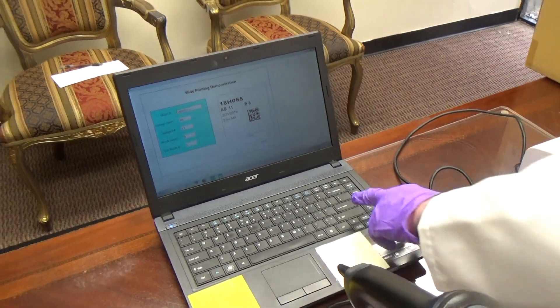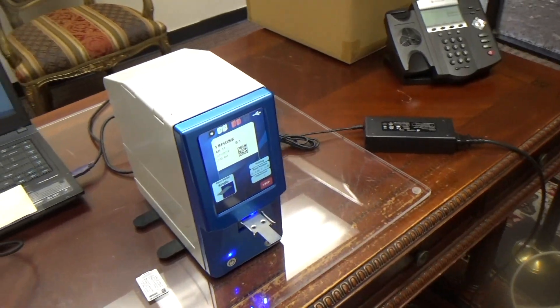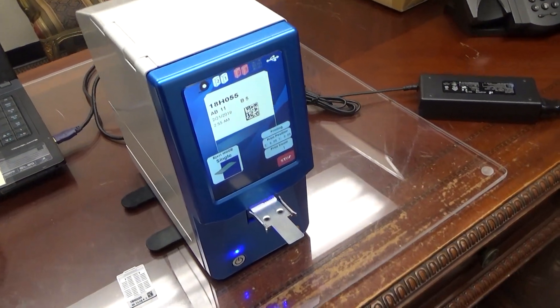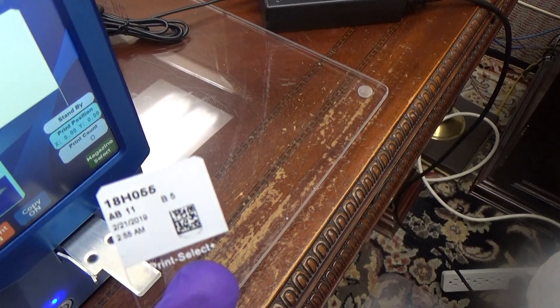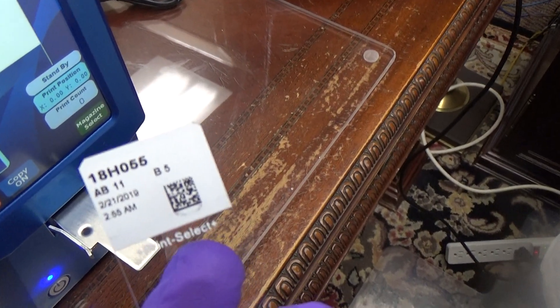To scan a cassette is a very simple process. Scan the cassette and then press print. Here is an example of what the slide looks like once the exact information you have requested has been printed.